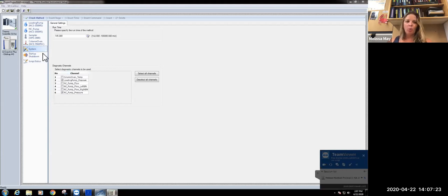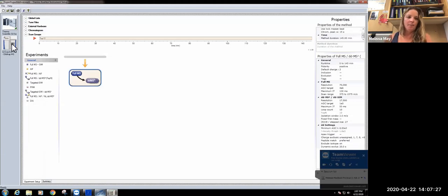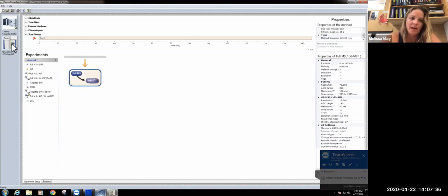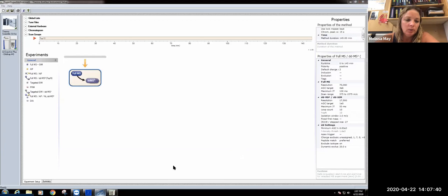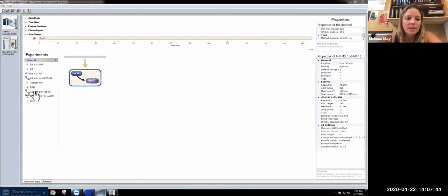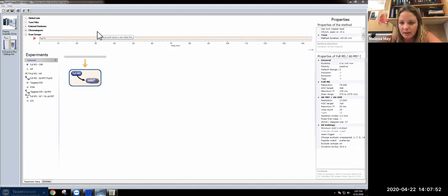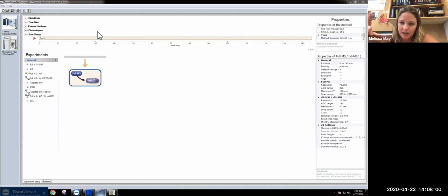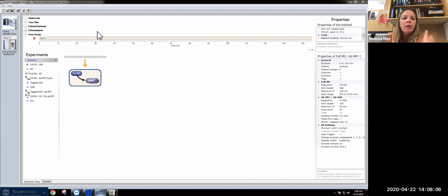For the Q Exactive, we're running a full MS scan and we're also doing the tandem MS to actually do the fragmentation. To set this up, what we did was dragged over our little method. Specifically, what we're looking at is the top 10. What this means is that it's going to take the top 10 most abundant fragments that are being injected into the instrument at any time and send them into the MS2 for analysis.